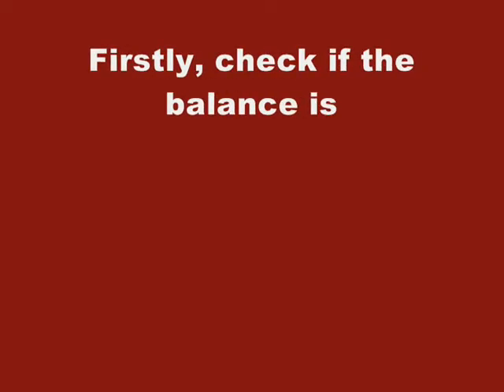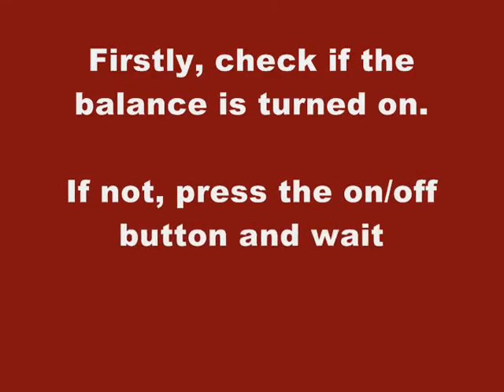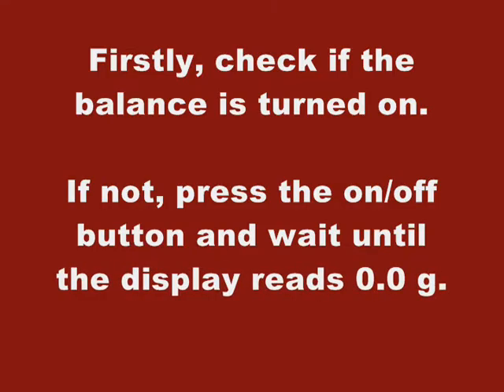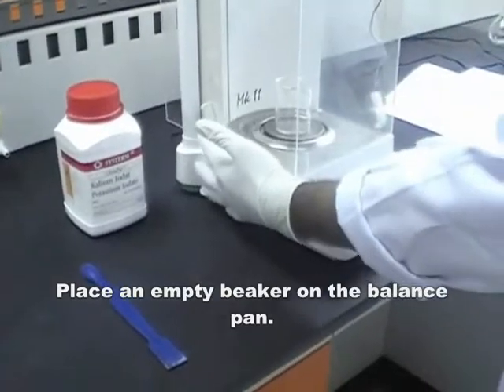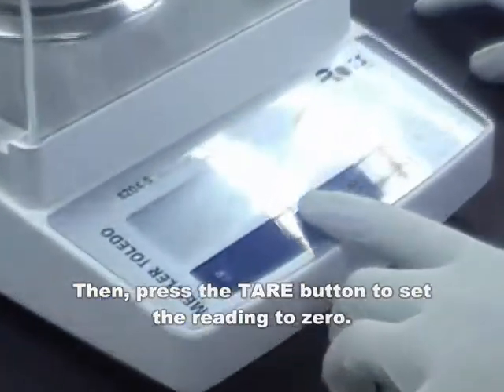Firstly, check if the balance is turned on. If not, press the on or off button and wait until the display reaches 0.0 gram. Place an empty beaker on the balance pan, then press the tare button to set the reading to 0.